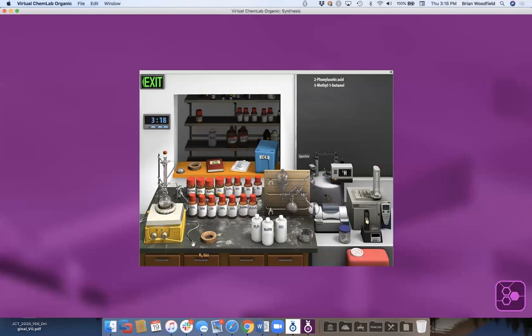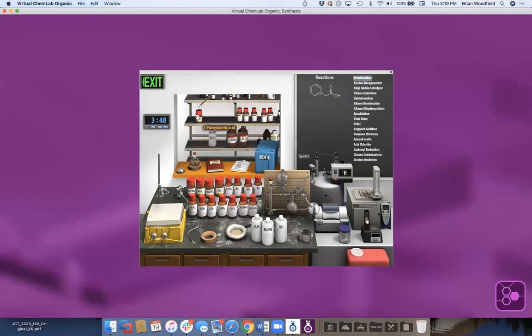Like, what if they forget to add their nitrogen? So it's a sealed system. And what happens if they decide to start this reaction and then start advancing their time, and then it's going to blow up and show them a consequence of what happens, that, hey, I forgot to add my nitrogen. So I'm going to clean up, add my starting materials again, and come back there. So now I'm going to do it for real.